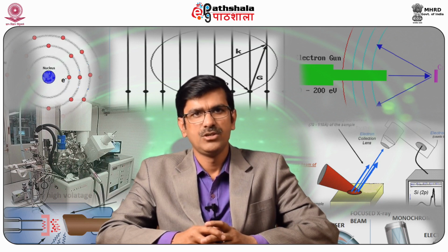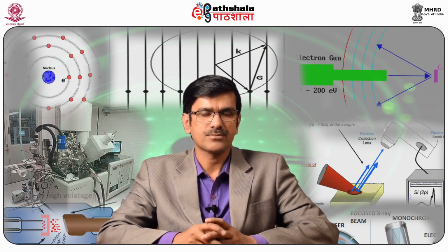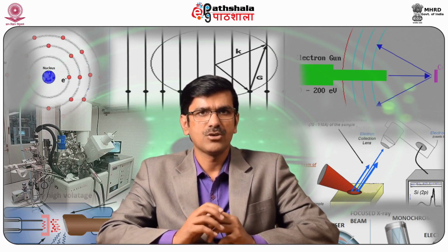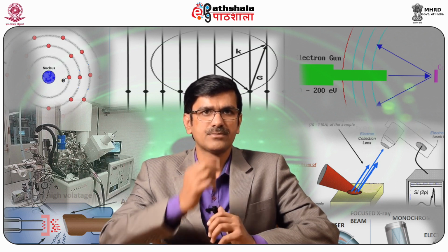Point 5, use of a focusing monochromator means that only the area of the specimen being analyzed is exposed to X-rays. Thus, a number of samples may be loaded into the spectrometer without the risk of X-rays damaging the sample while they await analysis. Similarly, multi-point analysis can be performed on the same delicate samples.